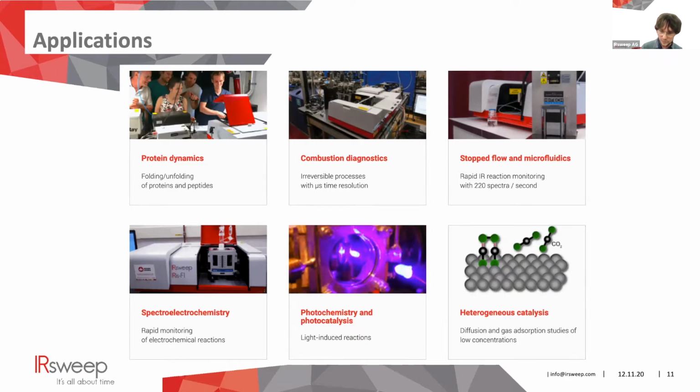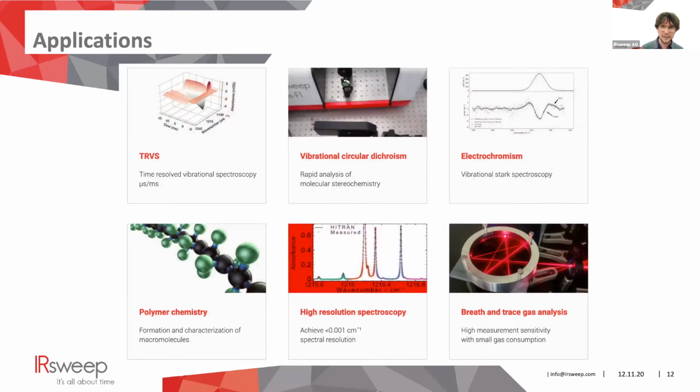And we have heterogeneous catalysis, TRVS, time-resolved vibrational spectroscopy, VCD, we have done some experiments, electrochromism, polymer chemistry is important, and high-resolution spectroscopy, including breath and trace gas analysis. So let's have a look at the high-resolution spectroscopy.